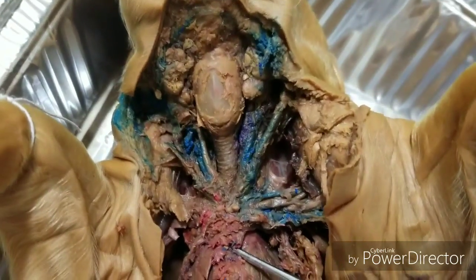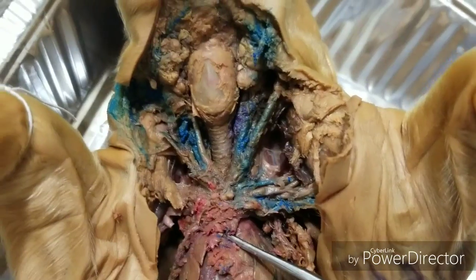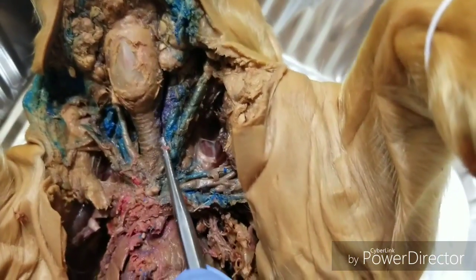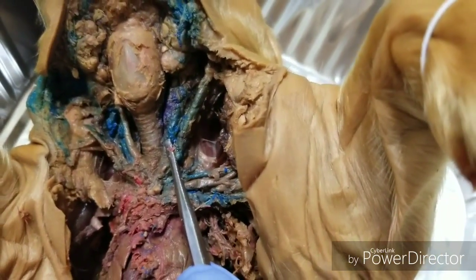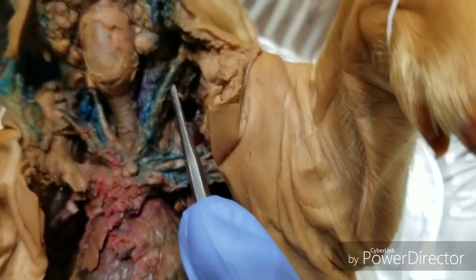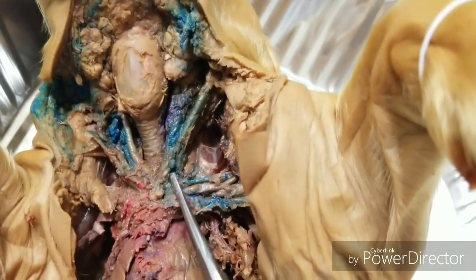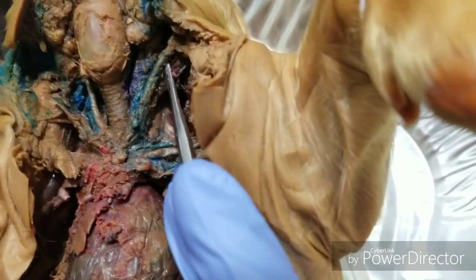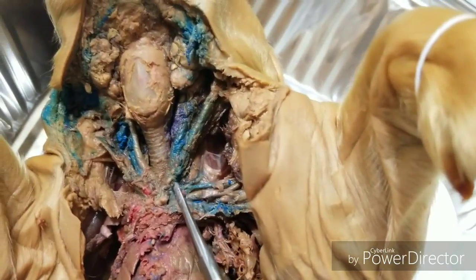We next have our external jugular. So we did say that the internal jugular would be right here, which makes this one also the internal jugular. So the external jugular, to my best knowledge, would be right here. Going down right here would be the external jugular. This specifically is the left external jugular.